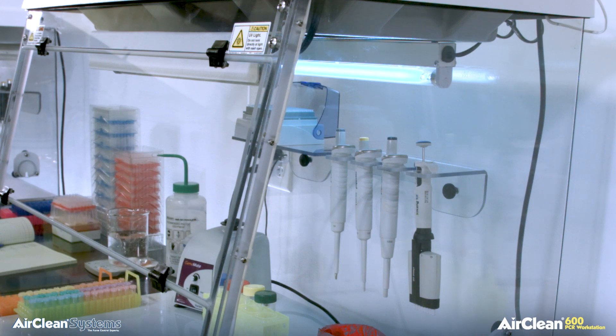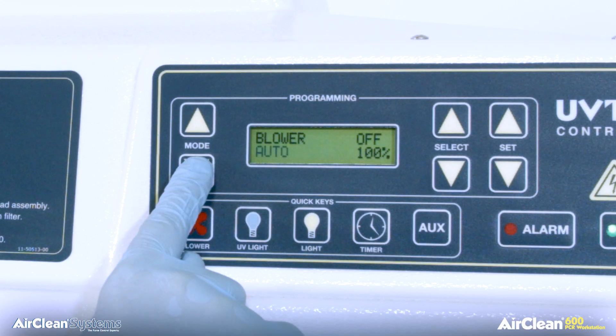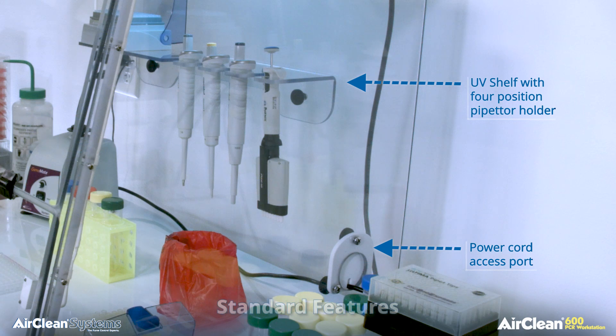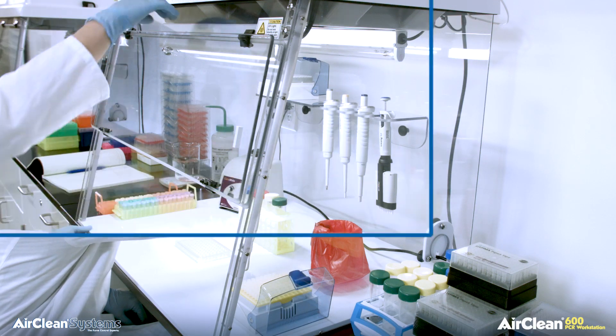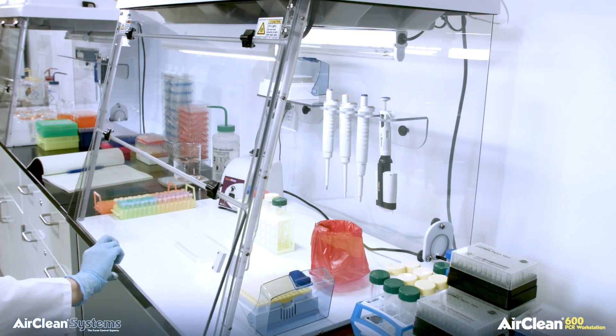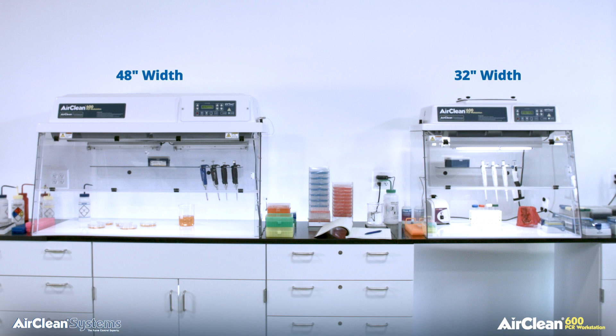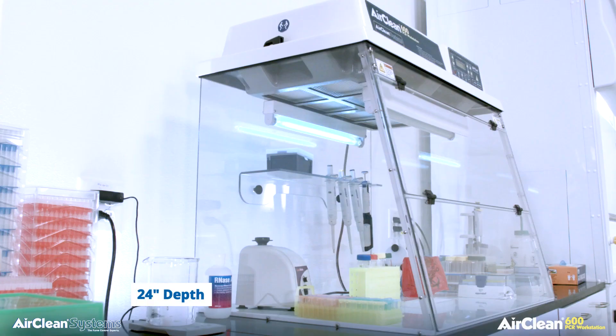Airflow in the combination PCR workstation can be adjusted to complete absence. A UV shelf with a four-position pipetter holder and power cord access port are standard features on each AirClean Systems combination PCR workstation. The UV shelf allows for critical items to be placed closer to the UV light for greater exposure to UV irradiation. The combination PCR workstation with UV-TECT microprocessor controller is offered in two widths, 32 and 48 inch, with a nominal 24 inch depth.